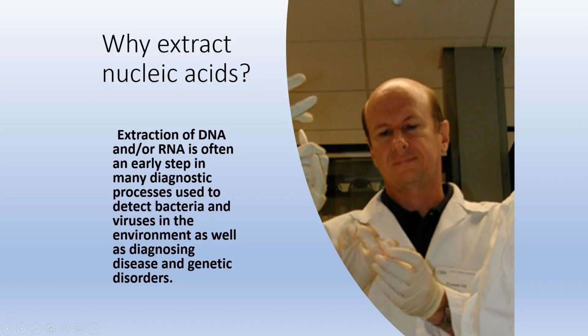So why would we want to extract nucleic acids? Well, the biggest reason to extract nucleic acid is to identify whatever it is that we're extracting the DNA from. That's one of the main goals that we usually have. It could be used to detect and identify bacteria or viruses in the environment or in a sample from a patient that we are trying to diagnose for a particular disease. So that would require DNA or RNA extraction as one of the early steps.